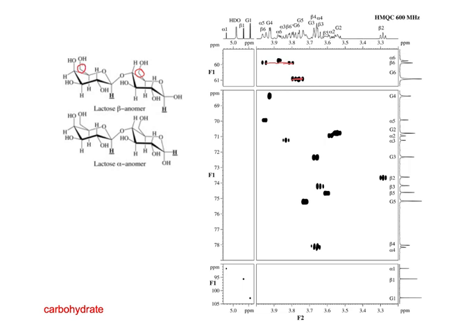And I think that in both cases they're together. They just have one set of signals. But this could help us separate things. Here's the 3 anomeric carbons.